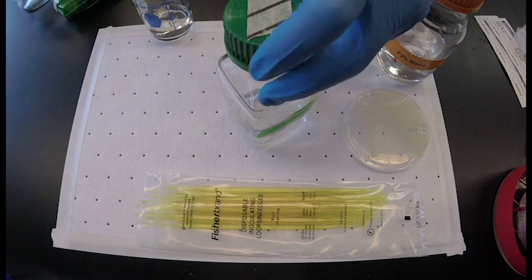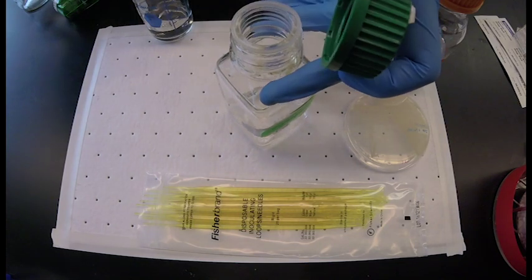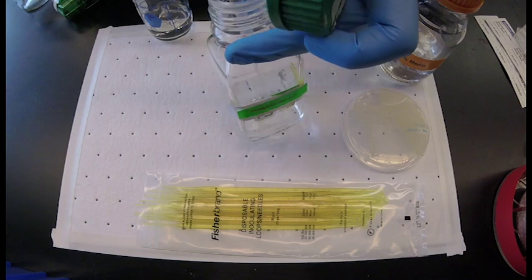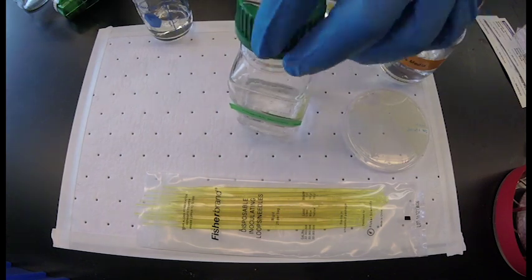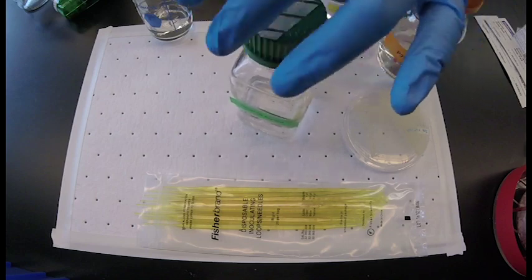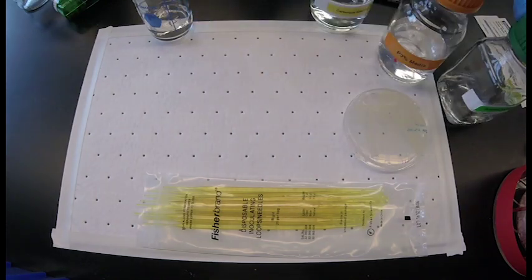There is half a milliliter of phosphate solution per 25 milliliters of P3%.